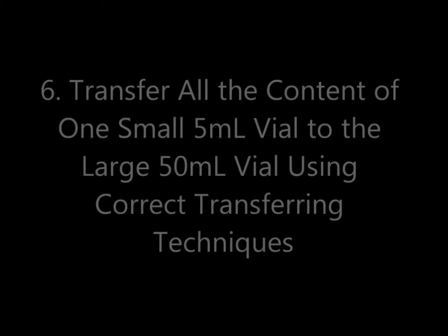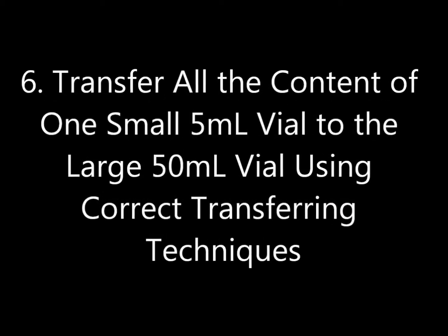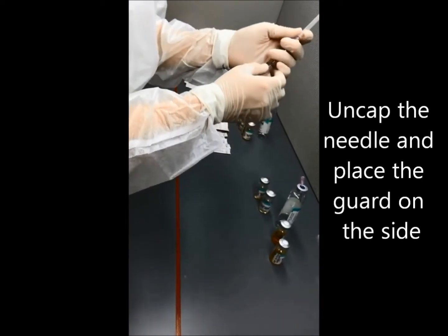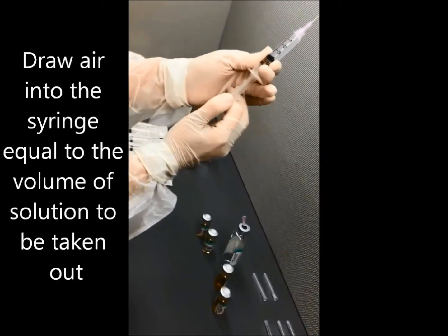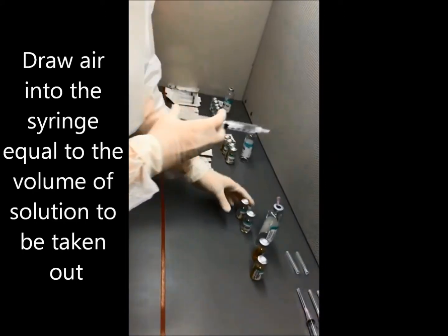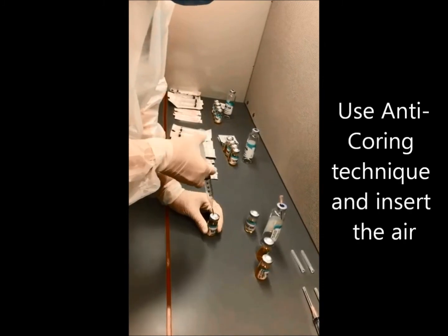Number six: transfer all the content of one small 5ml vial to the large 50ml vial using correct transferring techniques. Uncap the needle and place the guard on the side. Draw air into the syringe equal to the volume of solution to be taken out. Use anti-coring technique and insert the air.